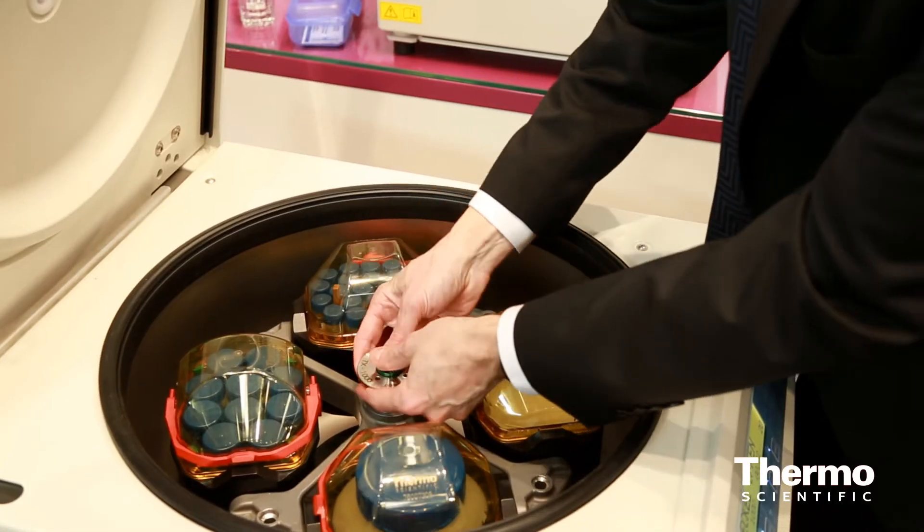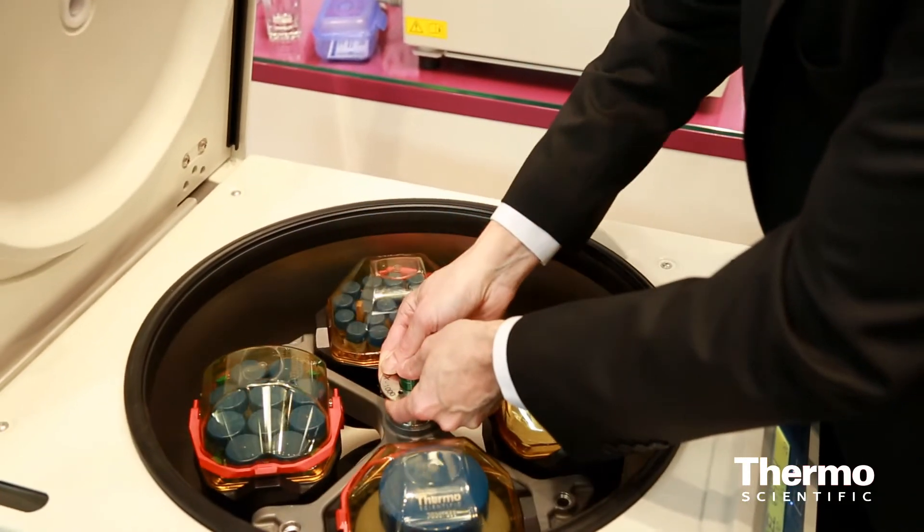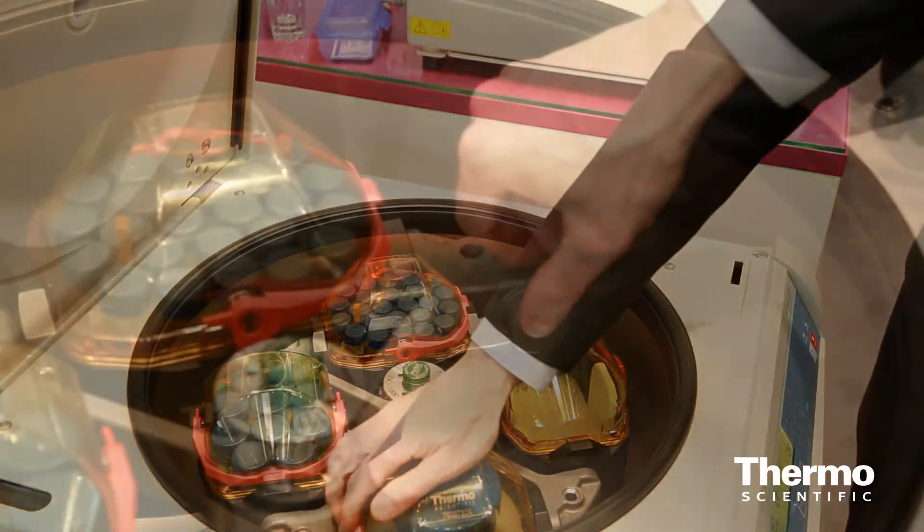Absolutely fantastic capacity. But there's more innovations that we're bringing. We're not only also bringing the auto lock, which we've had on the machine for the last few years — we've also got the new slide coats.